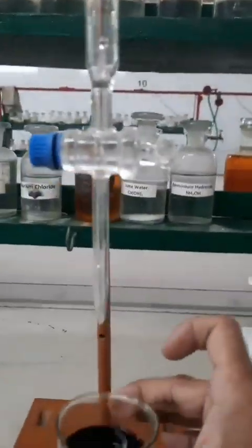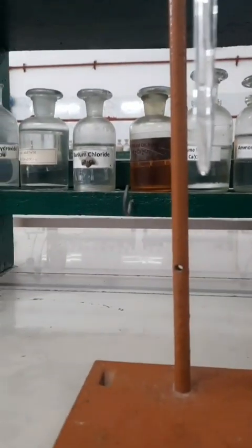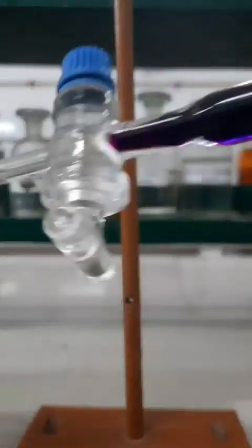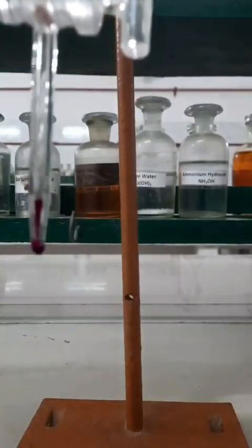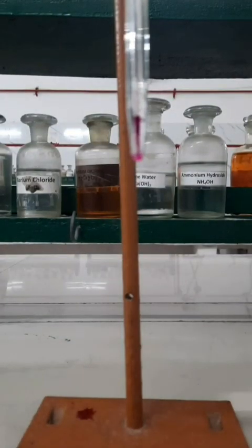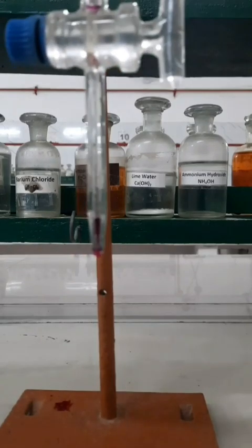Let us perform the titration of potassium permanganate solution with the help of standard solution of Mohr salt. Now here first of all you have to rinse the burette. I have taken a 25 ml burette and added a small amount of potassium permanganate solution, and I am rinsing the burette in order to remove the water present on the inner wall of the burette. Throw the solution after rinsing into the sink and clamp the burette on the burette stand, and then you have to fill the burette with the help of potassium permanganate solution.